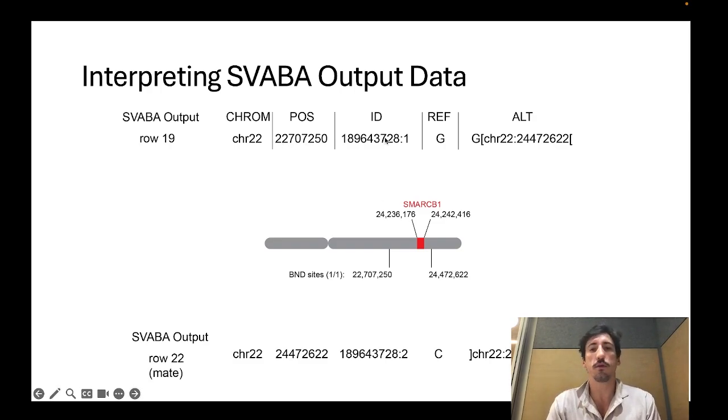That's really what this line is showing: some read was aligned to this part, and then at this particular nucleotide, it suddenly started aligning to this upstream region around 2 million base pairs upstream of the beginning of the read.